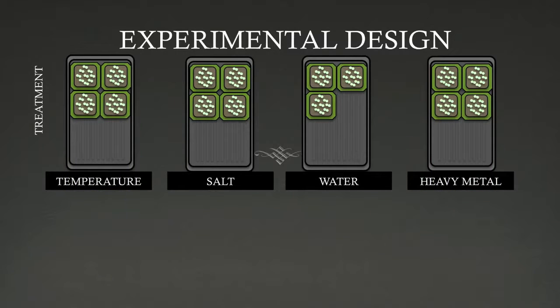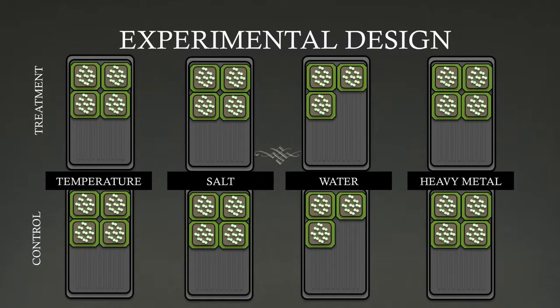Thus, conducting a full set of experiments in the Think Green module will require the planting of 30 pots growing on 8 trays. Depending on your particular situation, you may decide to assign experiments to individuals or groups and combine results for the class later.